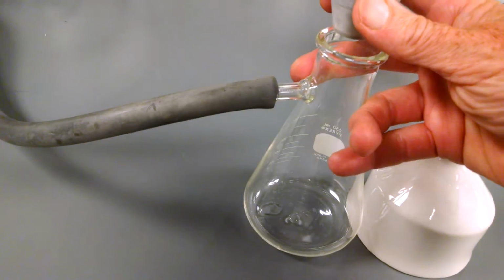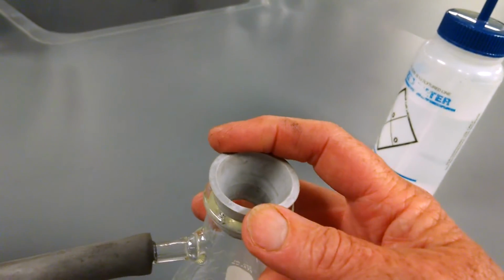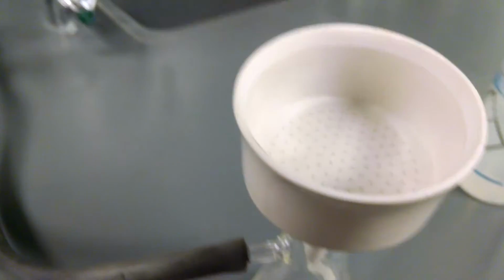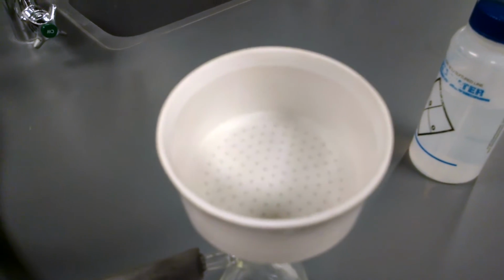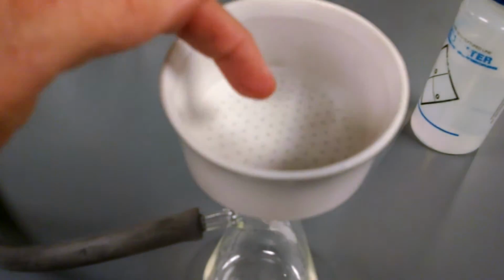So you've got this sidearm flask, which is connected with a hose to the vacuum outlet. You have this collar, and inside the collar I have my Buchner funnel with my filter paper. I'll put my solid banana in there, I'll run the vacuum, and that'll help to dry it out. We'll add a little bit of acetone that will dry it further, and then perhaps we can even put it in an oven for a while to dry it more. So that'll be the starch.